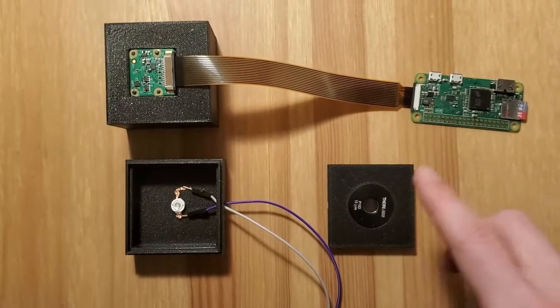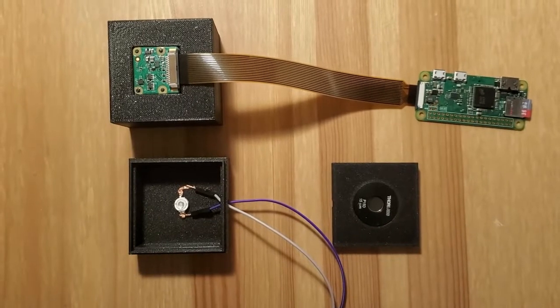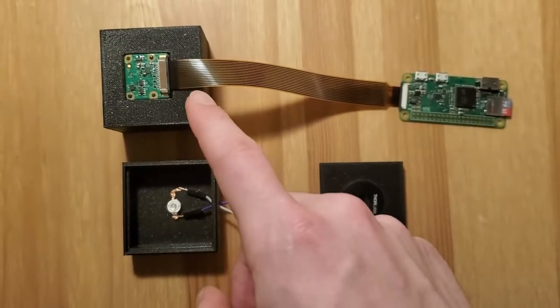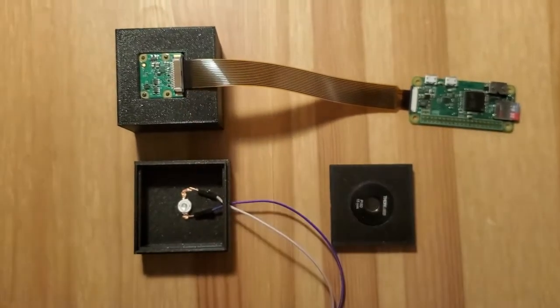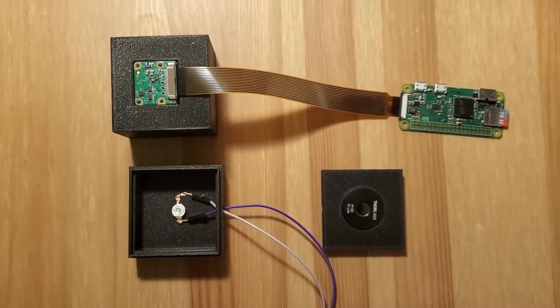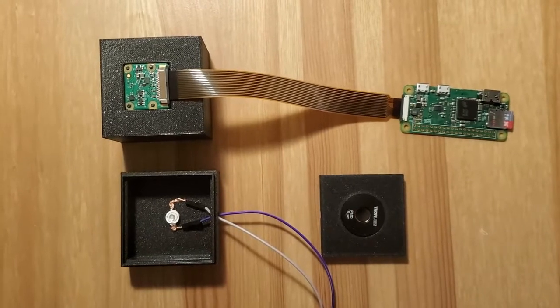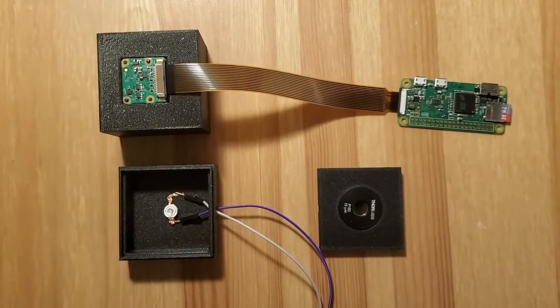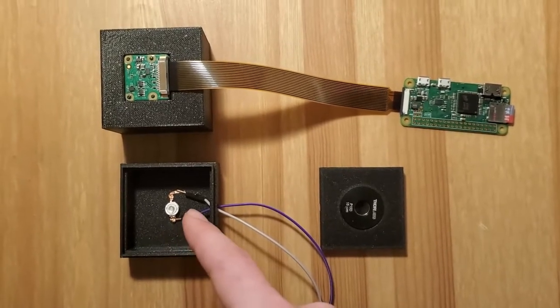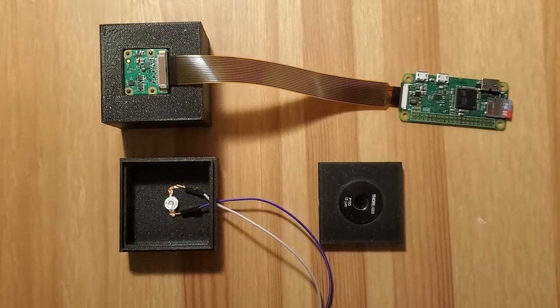The system consists of 3D printed parts, which are basically just there to hold the different components in place. There are two electronic components — basically the Raspberry Pi and Raspberry Pi camera — and the LED, which is the light source. And then there's one extra special component, which is the most expensive part of the entire build, and that's basically a 15 micrometer pinhole, which converts the LED to a point light source and kind of acts almost like a lens in some ways.